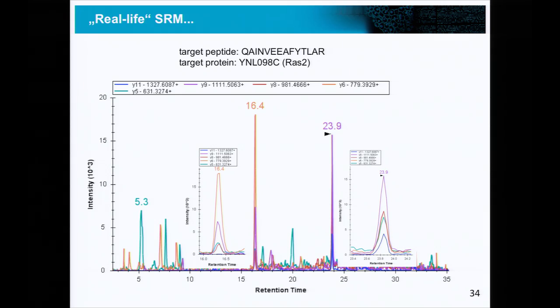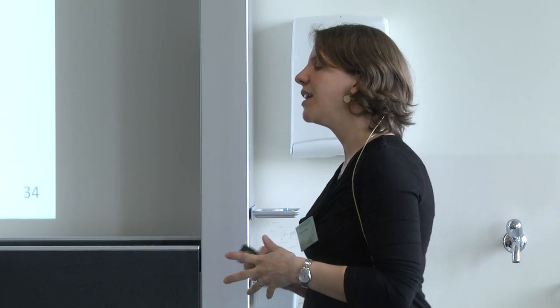But nevertheless, I would never ever publish a paper with these 2 peaks and with having only peak shape, coelution, and intensity as the criteria, because you can really not be sure. So the people who didn't raise their hands were actually right, because you don't know. You can really hardly judge from what I show you here. So what you need is more information. So what can we do?